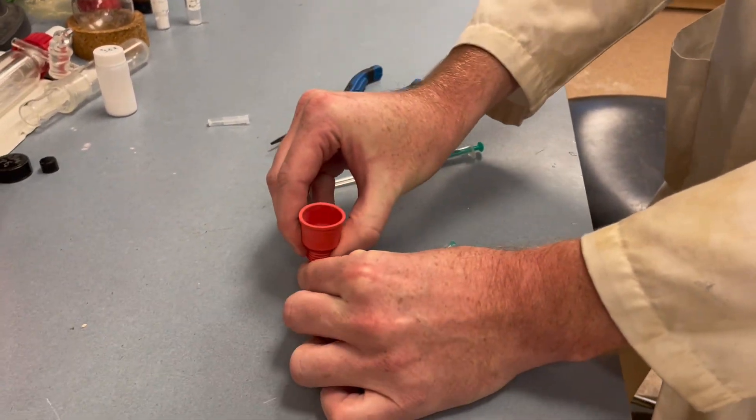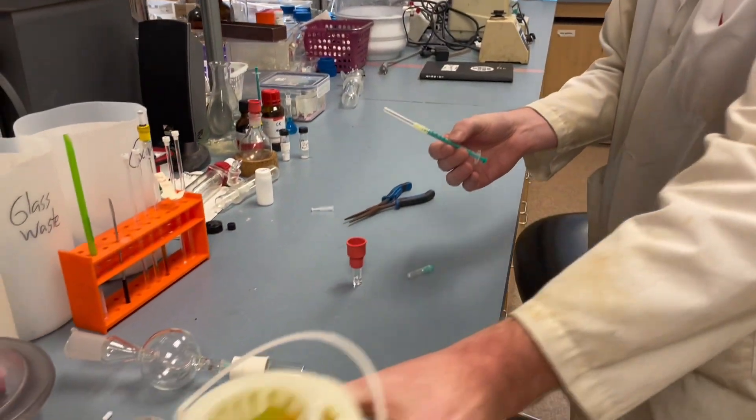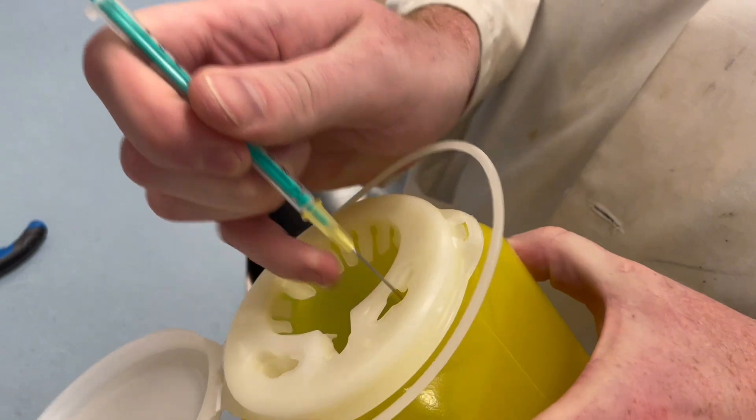So the first thing that we need to do is get a sharp tip needle which we use to initially pierce the septum, and we can remove the cap from it using the sharps container like this.